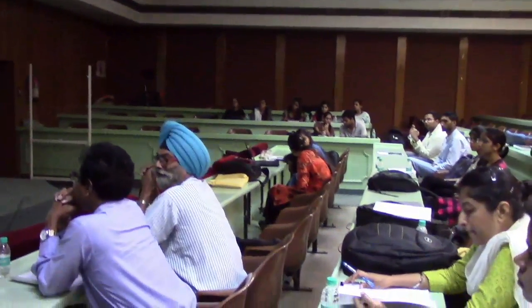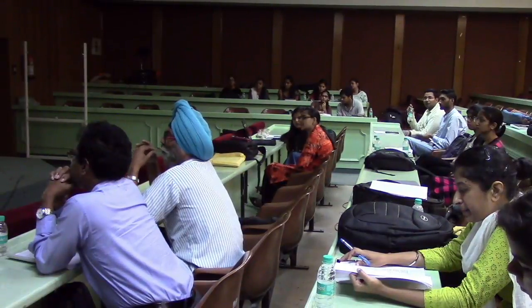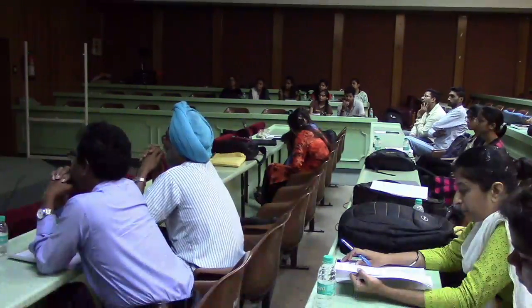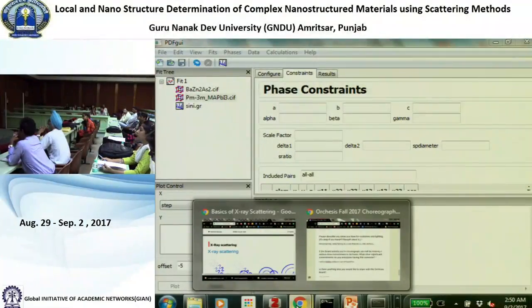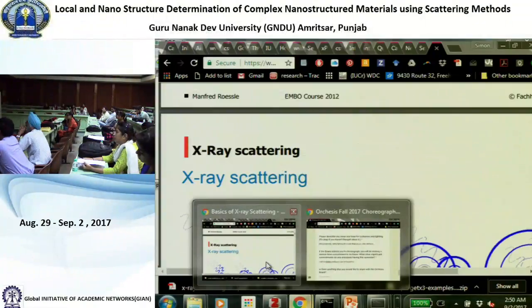Firstly, go and read the DiffPy users Google group to see if your question is already answered. Let me do that now so that you've got an example. You say, oh, I don't know how to do two-phase refinement, but actually you should be able to figure that out from the manual. So firstly, read the manual. If you can't get the answer from the manual, read this book that we gave. If you can't get the answer from that, then go to the Google group.